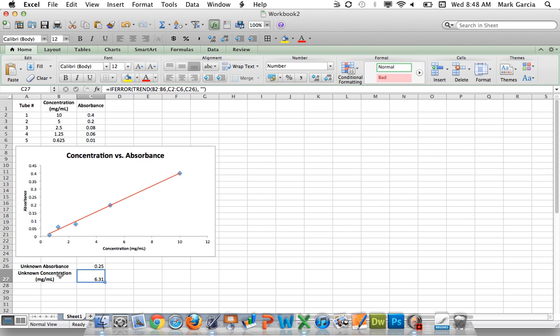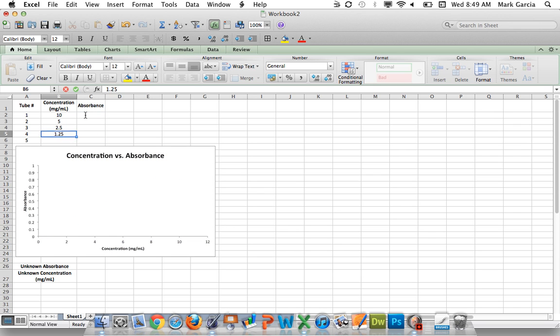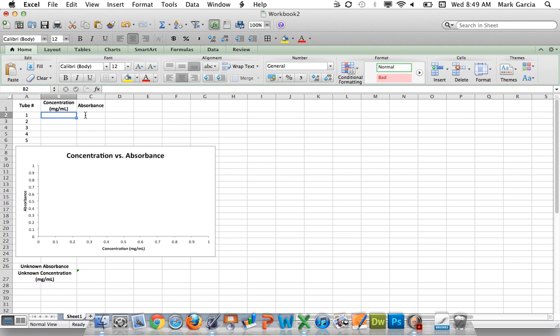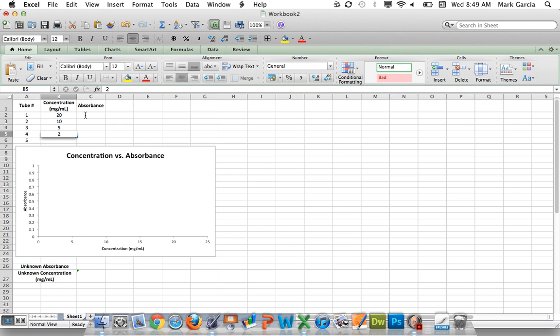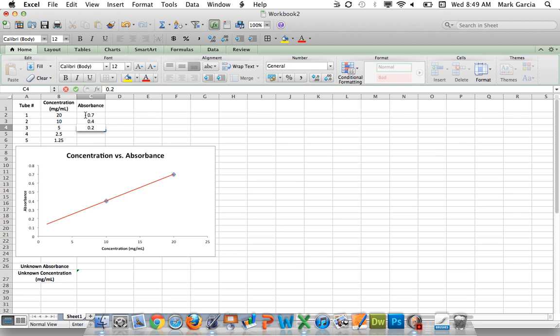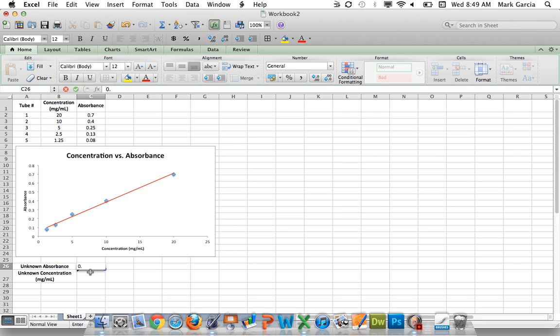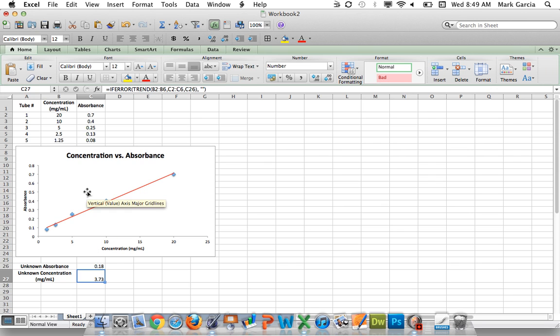I now have an unknown concentration based off of the absorbance I obtained for my unknown sample. So just to show you that this always works, I'm going to actually delete all the values and I'm going to type in a new serial dilution with new absorbance values. 0.13 and how about 0.08? So I've got my trendline, my data points, and then for my unknown absorbance, let's say I pick something between 2.5 and 5. So I'll pick 0.18 and 3.73, which happens to be between 5 and 2.5.